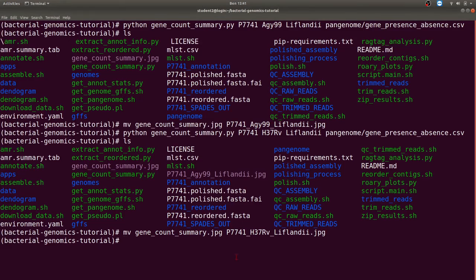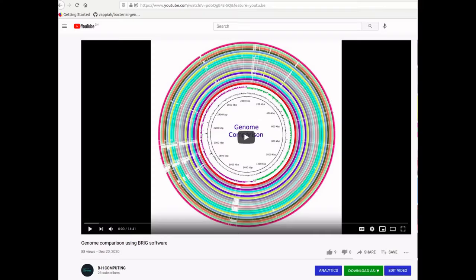The next step is to generate ring structures, which will enable us to visually compare the genomes. To do that we use the software called BRIG. I've made a video on this particular activity and the link can be found by clicking the notification above. The tutorial is easy to follow and apply, so I encourage you to do that as soon as possible.